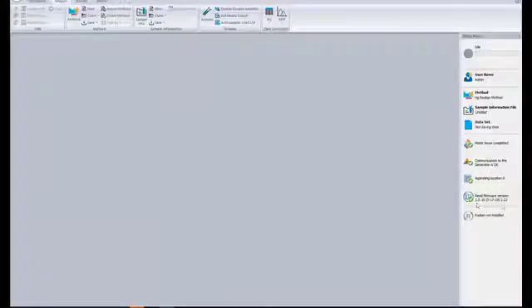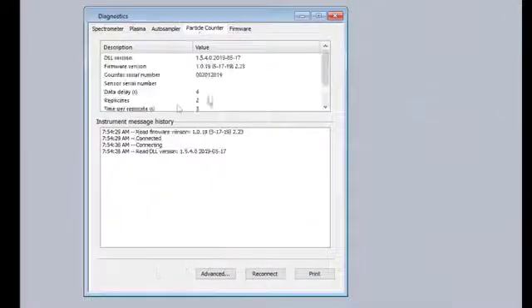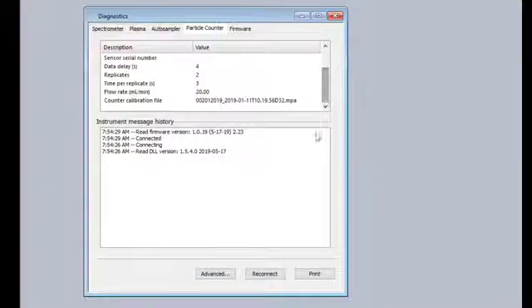Once configured, Syngistics should show the liquid particle counter connected icon in the status panel. A tab in the Diagnostics window has also been added to provide basic system information to log commands and responses between Syngistics software and the LPC 500 counter.